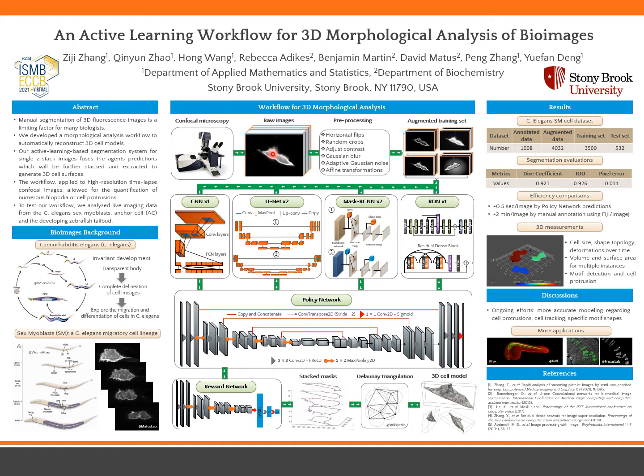Raw images captured by confocal microscopy are pre-processed to augment the actual training set. Then, individual 2D images will go through a semi-unsupervised learning system for segmentation. This method, we have published in another journal paper.